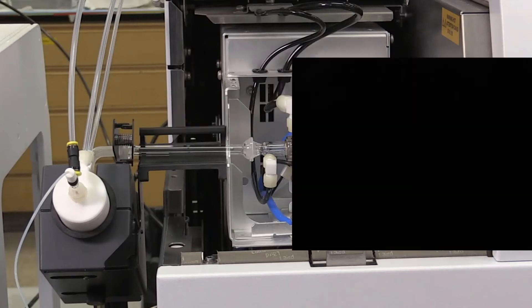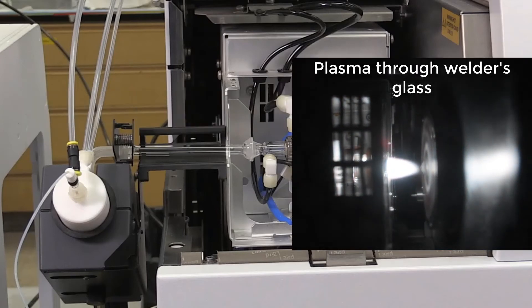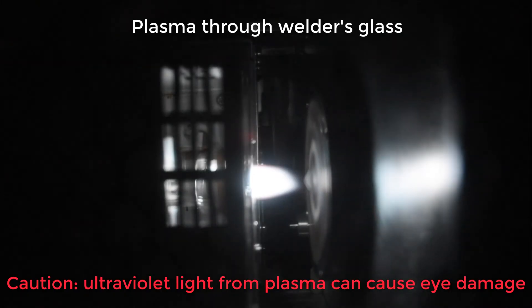The core component of an ICP is the high-temperature plasma used to atomize samples. The torch generates a plasma from an argon source.